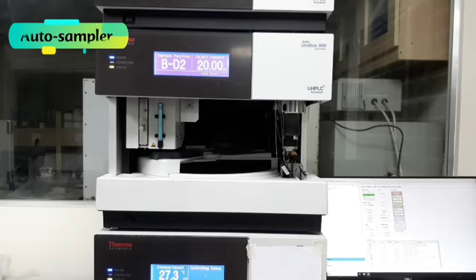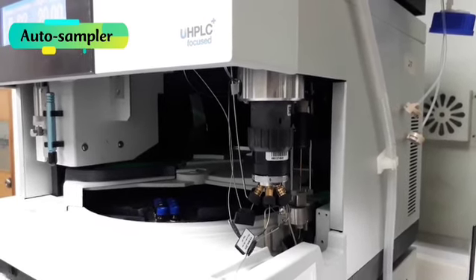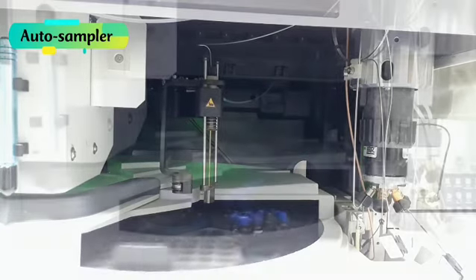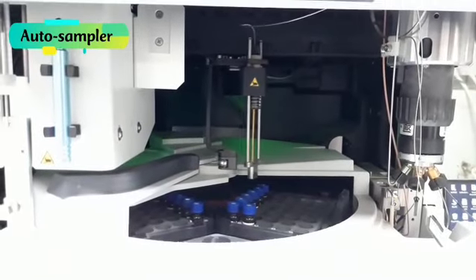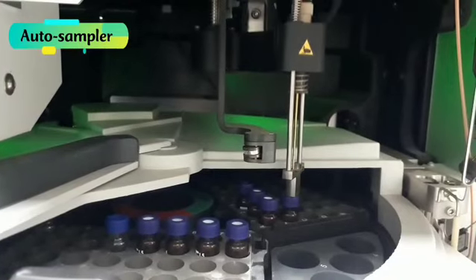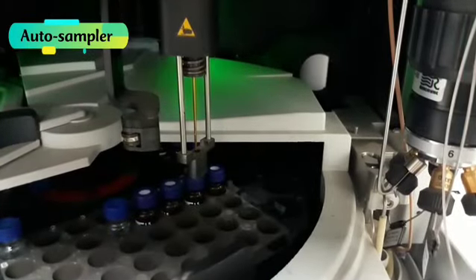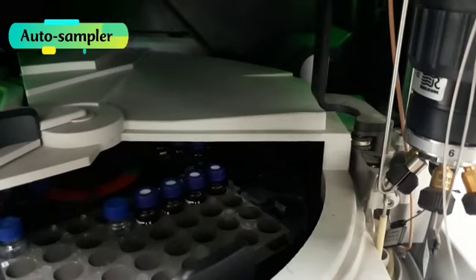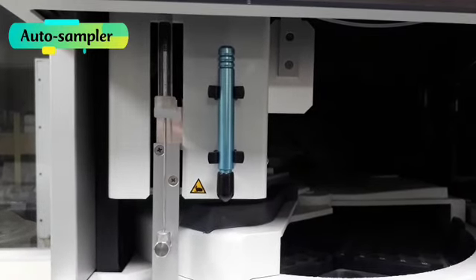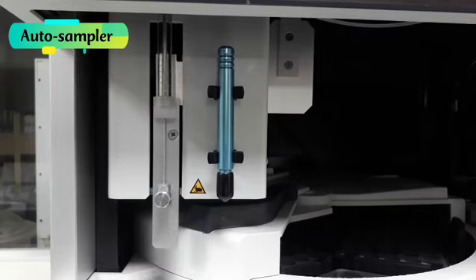Features of HPLC: a high pressure system, which uses a pump to push the solvent, the mobile phase, through the column at pressures up to 6000 psi. The column is packed with a stationary phase, which may be silica or polymer based material. Detectors such as UV, fluorescence, mass spectrometer or refractive index detector measure the separated compounds. Automation: modern HPLC systems are computer controlled for precision and reproducibility. Versatility: it can separate both organic and inorganic, polar and non-polar molecules.